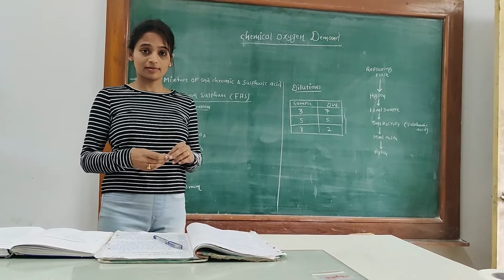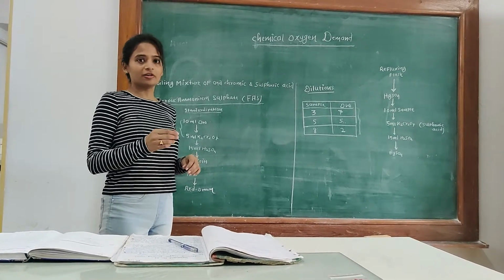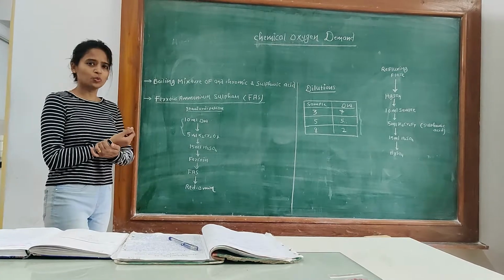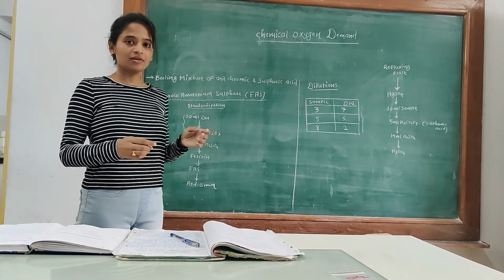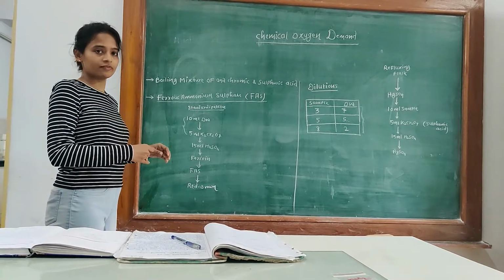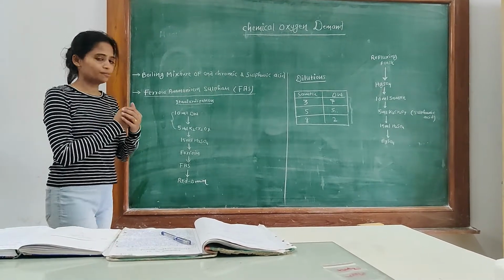Chemical oxygen demand. This is one of the most important experiments in environmental engineering. You will learn much more about this concept in your theory class. So let's just start with the experiment and the principle. We'll just overlook the principle. Go through your procedures and read the principle.